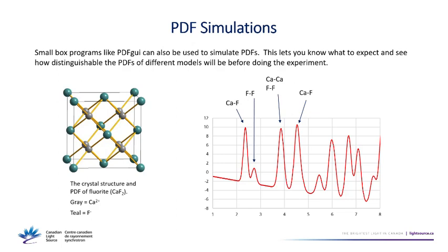I believe so. That's what SAXS does. Adam's going to talk about that tomorrow in more detail. So I'll let him do that because I know that it's roughly possible to do, but it's not my area of expertise, so I won't try to go into that. But yeah, if you go to really long wavelengths and really small angles, then you're getting the same kind of diffraction effects, but it's not between atoms, it's between particles. So longer distances there, essentially. But yeah, that's the right concept.